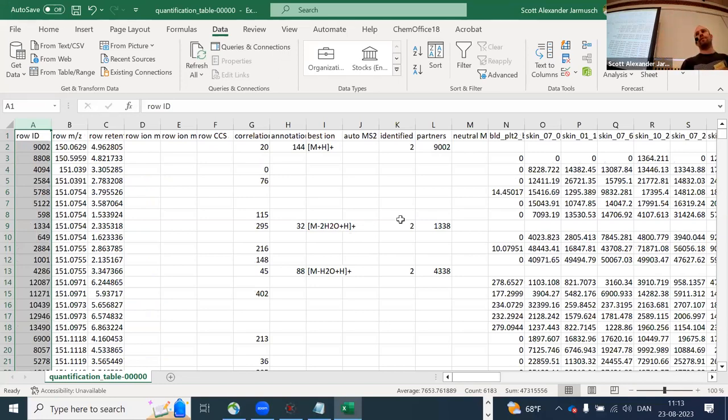From a very basic perspective, this is now our molecule table. If you dealt with sequencing data and ASV tables before, this is kind of an equivalent. And now all the table juggling in Excel, R, Python, or whatever, you can do the same way you may have done it with other data types.